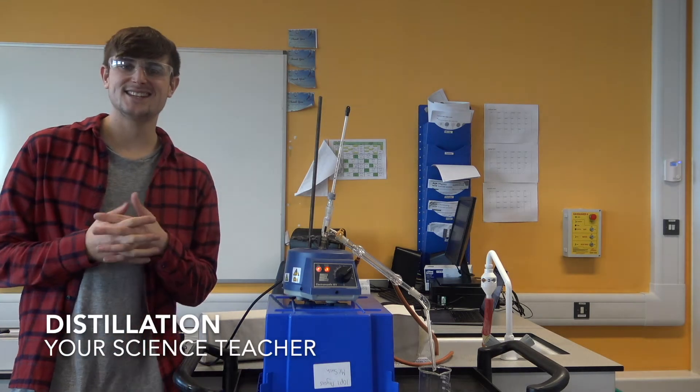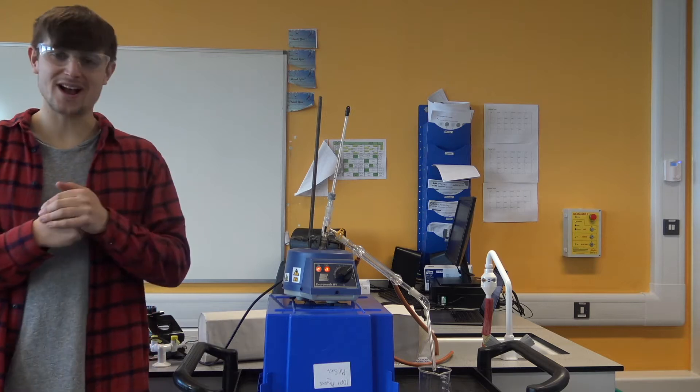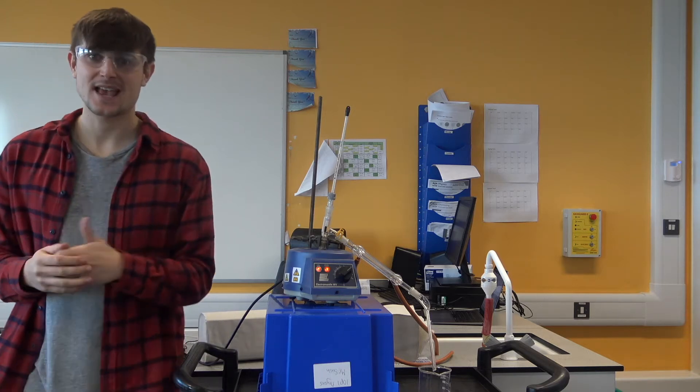Hi guys, it's your science teacher. In this video I'm going to go through how distillation works in order to separate mixtures.